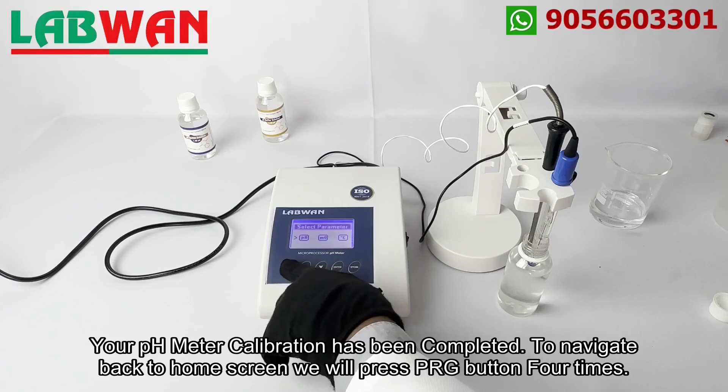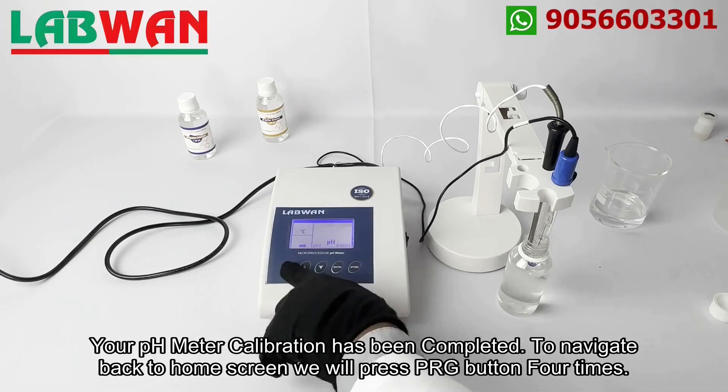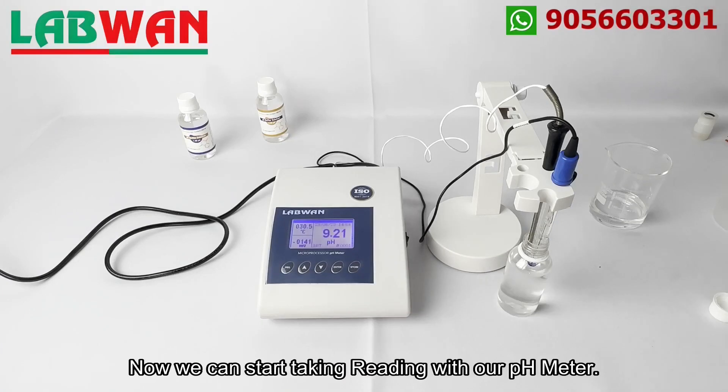Your pH meter calibration has been completed. To navigate back to the home screen we will press the PRG button 4 times. Now we can start taking readings with our pH meter.